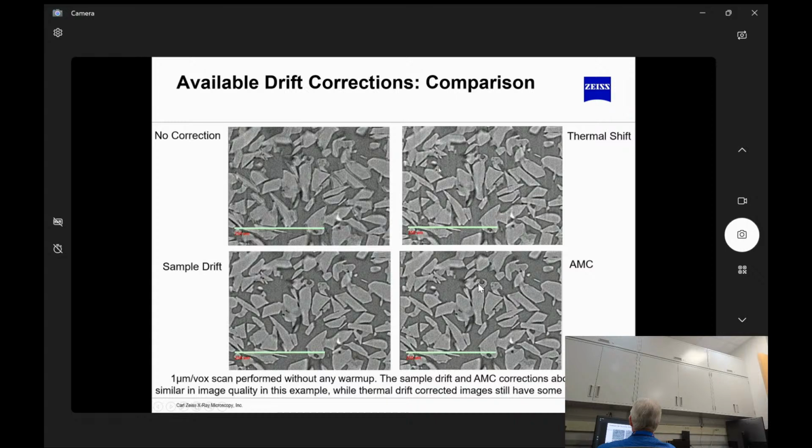But I'm also going to be looking at drift corrections, because nothing's ever perfectly stable in an X-ray system. I can look at a picture I take during the scan versus a picture at the end of the scan, and overlap and shift them so that I get the best sharpness in the final analysis.